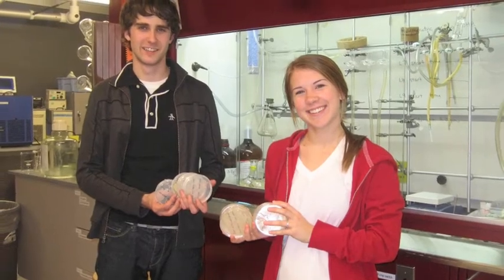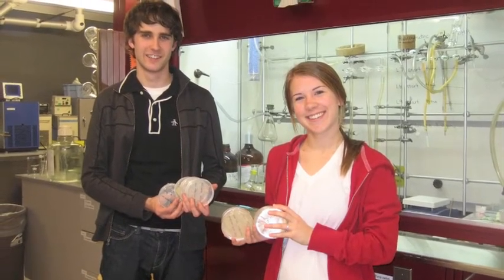For us, sterile technique was the hardest thing to learn. At the end, we had about 10% of plates go bad just after pouring them. I don't know if that's high or normal — it's probably a little bit high. We probably could have done better.